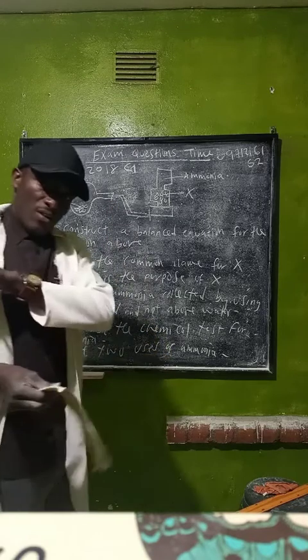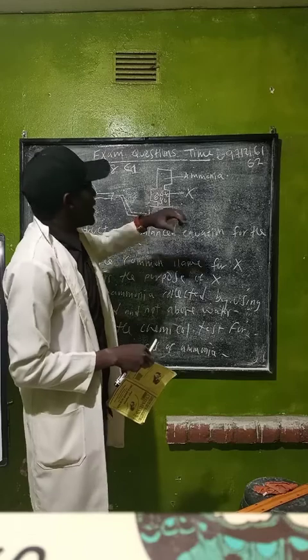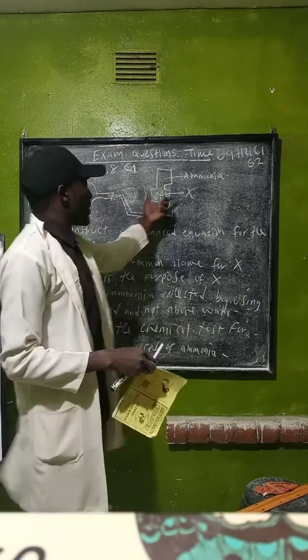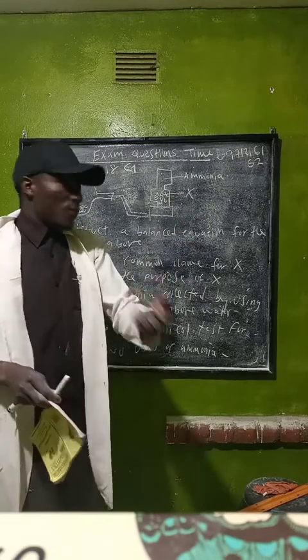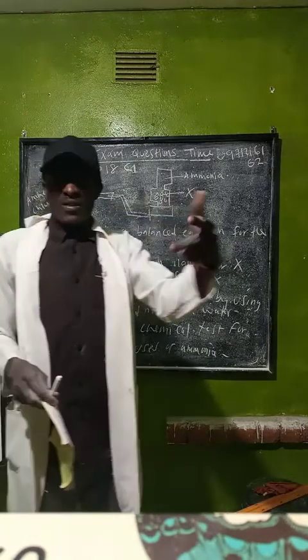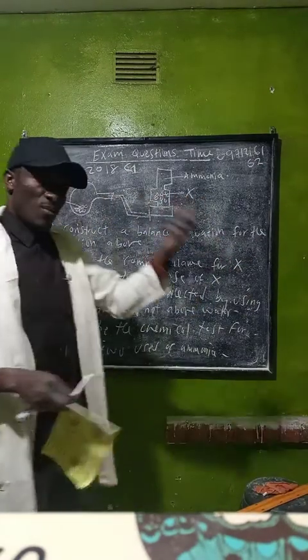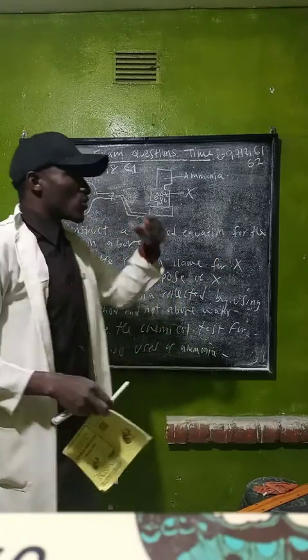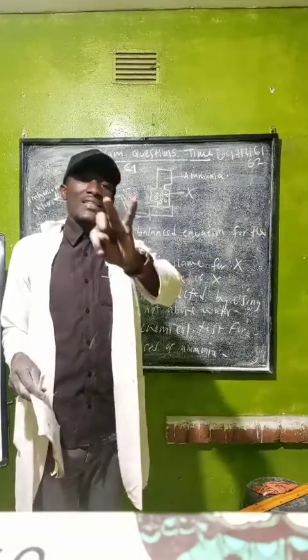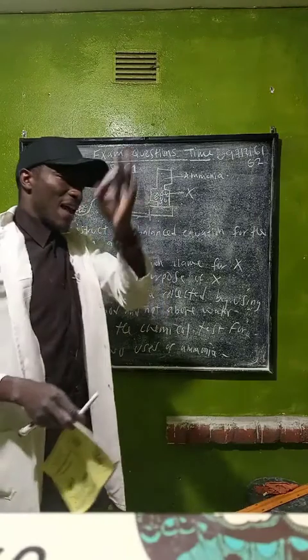If you followed the video, I had to mention that the substance here acts as a drying agent. Calcium oxide is the best for substance X. But they are saying the common name. It's not calcium chloride, and it's not calcium oxide. The common name is quicklime. I mentioned it about 3 times in the previous video. Quicklime. Slaked lime is calcium hydroxide, and calcium carbonate is limestone.